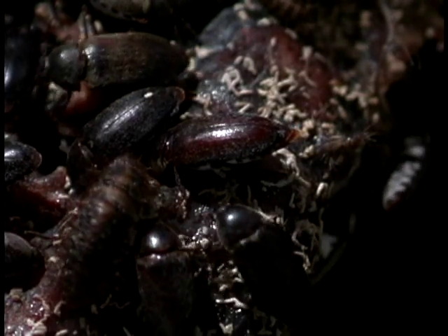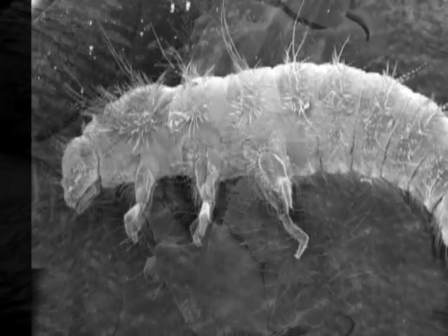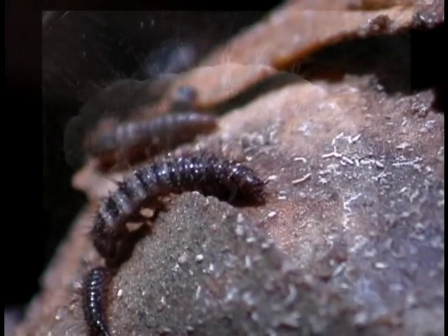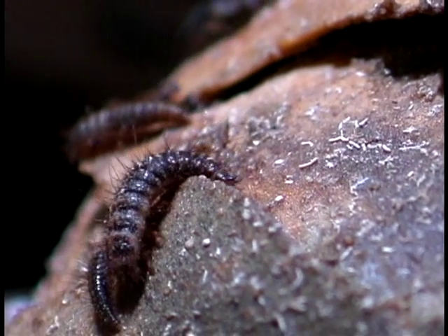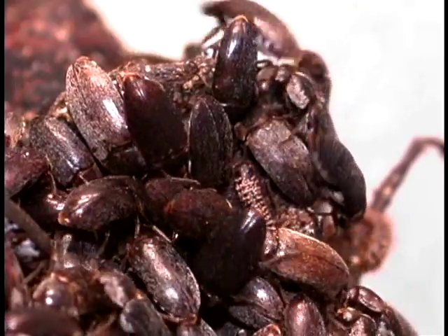Adult beetles have strong mouth parts capable of removing the toughest tissue from bones and shells, and the worm-like larvae can wiggle into small cavities in the tiniest skeletons. Dermestids only eat soft tissue and leave intact even the most delicate skeletal structures.